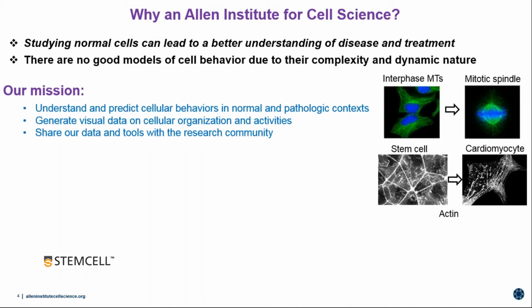We believe that the way to really study and understand this is to do live, high-resolution quantitative imaging. This is what we plan to do to understand the organization of a cell and then the function down the road. One of our main goals and missions is to share our data and the tools, both on the cell side as well as the computational side, with the research community.